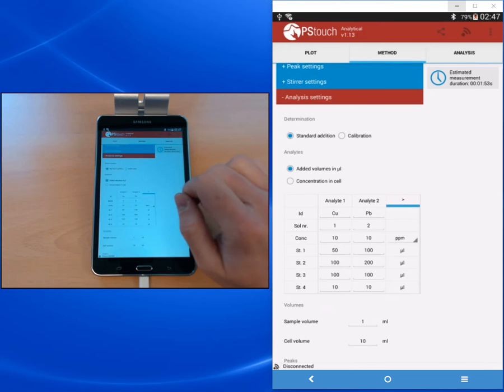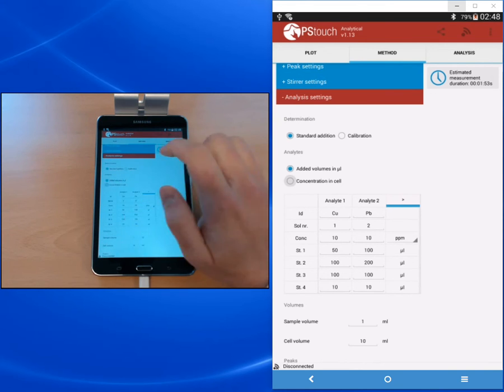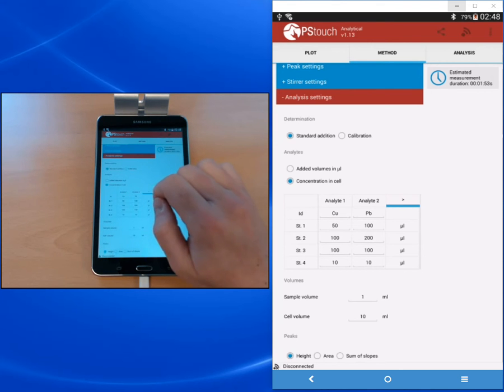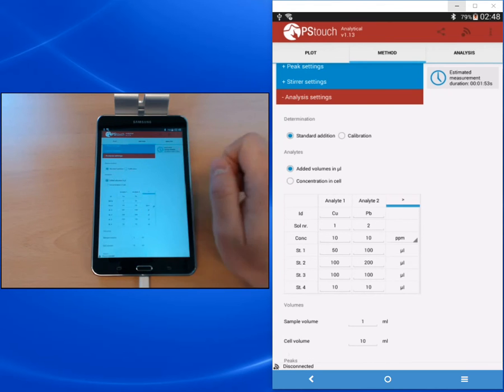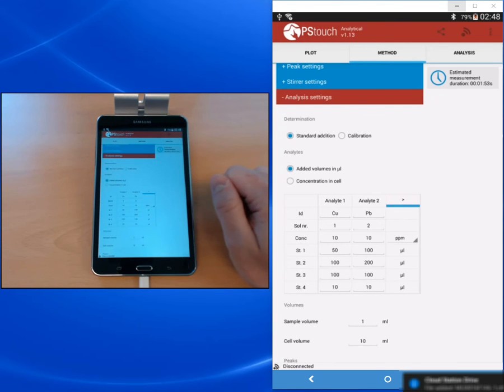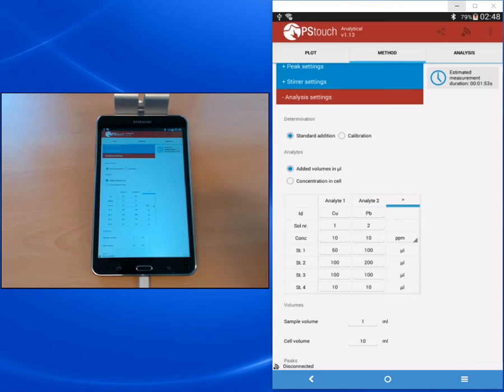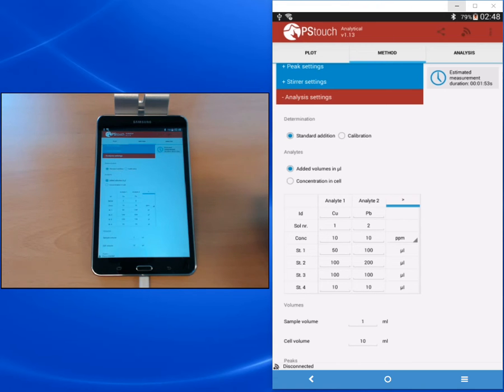The next section is the analyte section where you can choose if you want to have the option to enter the added volumes or the concentration in the cell. When you enter directly the concentration in the cell, it's a bit fewer values to add, but with added volumes you need to enter all the information and the software will calculate the concentrations for you. The usual pairing is that the standard addition usually goes with added volumes in microliters, and the calibration curve usually goes with the concentration in the cell. In the standard addition you are adding your standard solution to your sample solution.